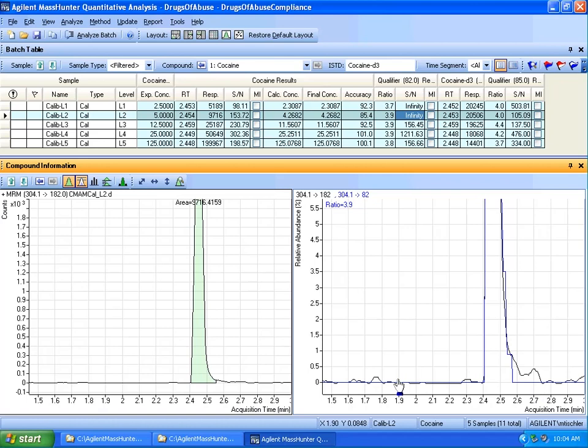Now, as I mentioned, there is an explanation of why zero noise occurs in MS-MS techniques, and the instrument design reasons why the triple quad produces such low noise. But I'll restrict myself here to the calculation. Well, if you're dividing by a very, very small number, then you are going to get a signal-to-noise calculation that is infinity. That's the math behind that calculation. That's the way it works.